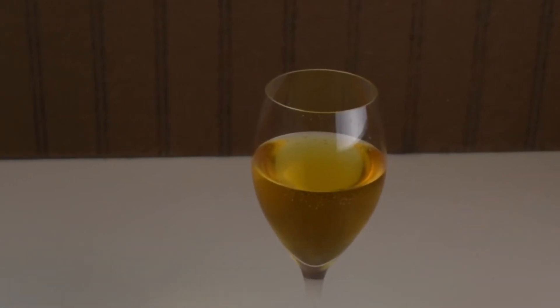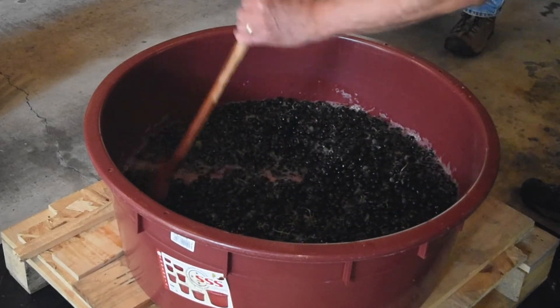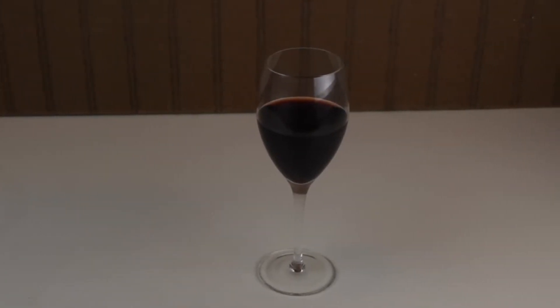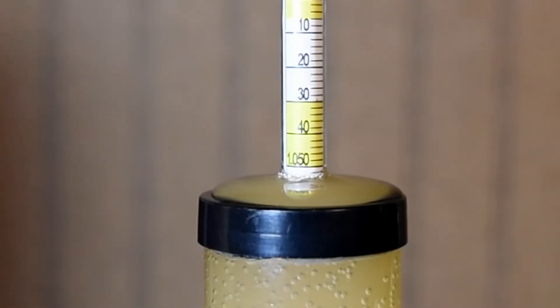So why is specific gravity important? It's important because it lets you predict the potential alcohol of your future wine, and it's a good way to follow the fermentation process and to know when it's completed.